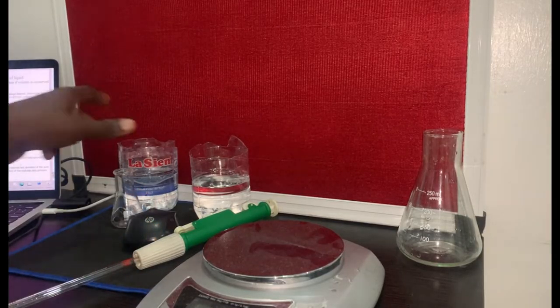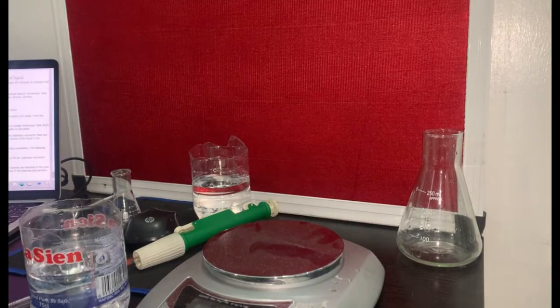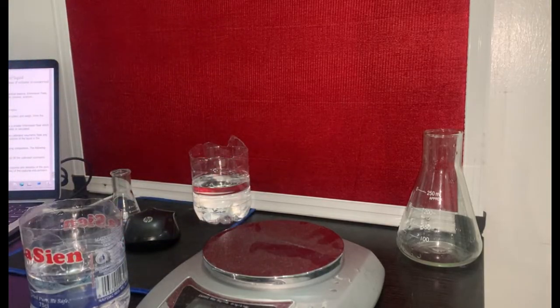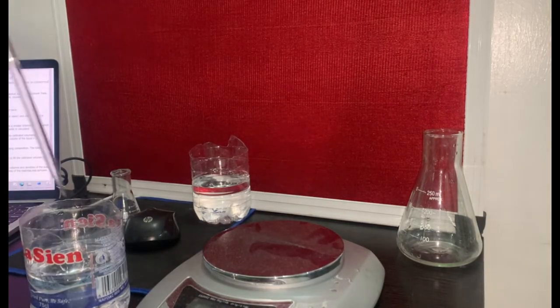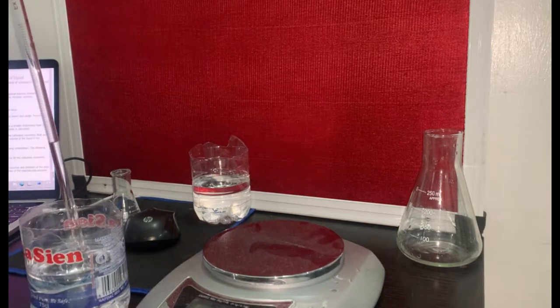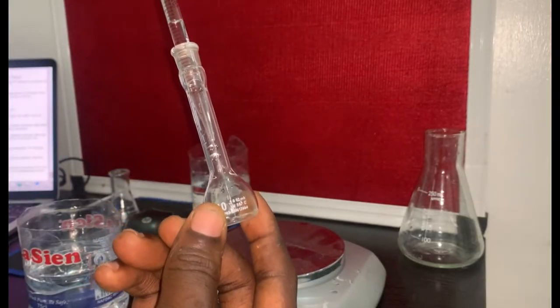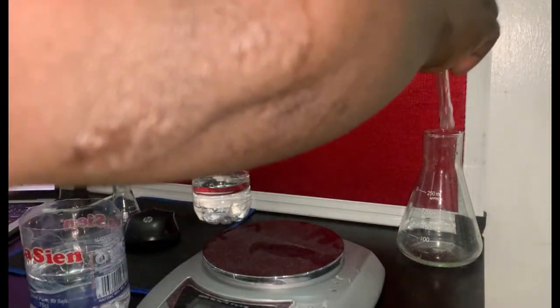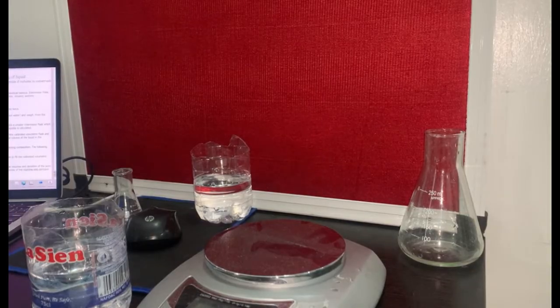The second liquid in this case is ethanol. Right, this is ethanol. Okay, so I have to first of all use this ethanol, take some quantity of this ethanol to rinse this flask. So I'll come here, I take a little quantity of ethanol, I'll put inside this flask just to rinse it. Okay, so we are set for procedure 3.